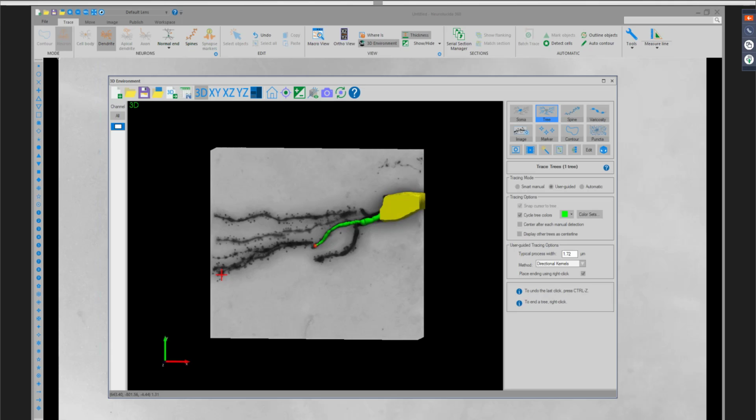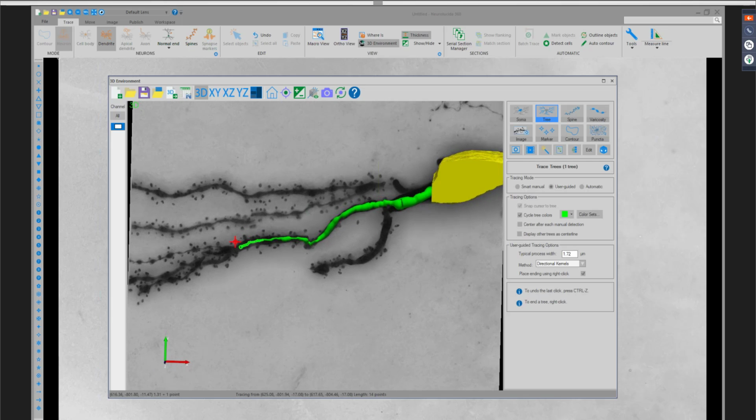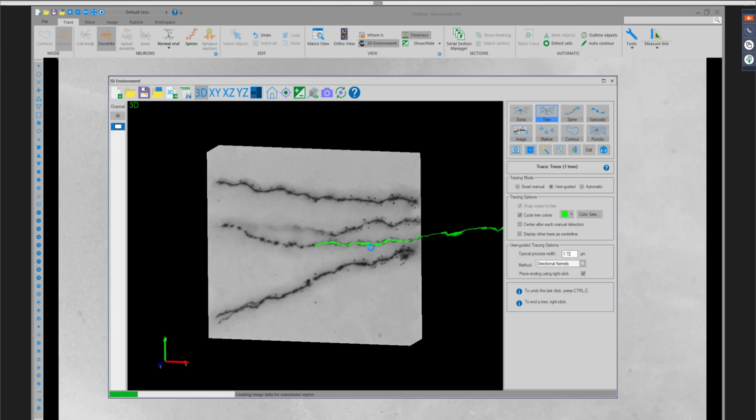And as I get to the edge of my boundary of my ROI or my subvolume, you'll notice that the program generates and moves. It will generate a new subvolume for me to work within based on the direction that I'm moving within the current subvolume. So because I'm working toward the left, the program is going to systematically build and shift that ROI to the left as well. I'm going to continue to trace just a little bit more. And now we can see a much vaster shift within the program, or the ROI rather, the subvolume. Once again, I'll continue and load the next region.